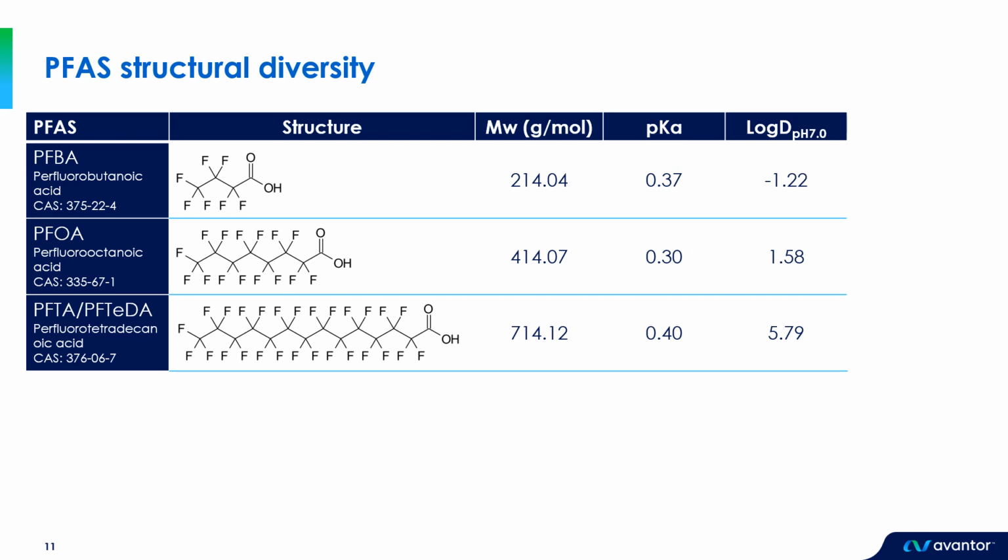We'll also need to use sample diluents that contain a very high percentage of organic, and this can cause some issues with our chromatography, which we'll look at a bit later on. Another point to mention at this stage is that we have potential for these sticky PFAS to adhere to containers when storing in the fridge. So it's important to make sure that standard solutions, calibration standards, etc. are allowed to reach room temperature and are well mixed before we use them.